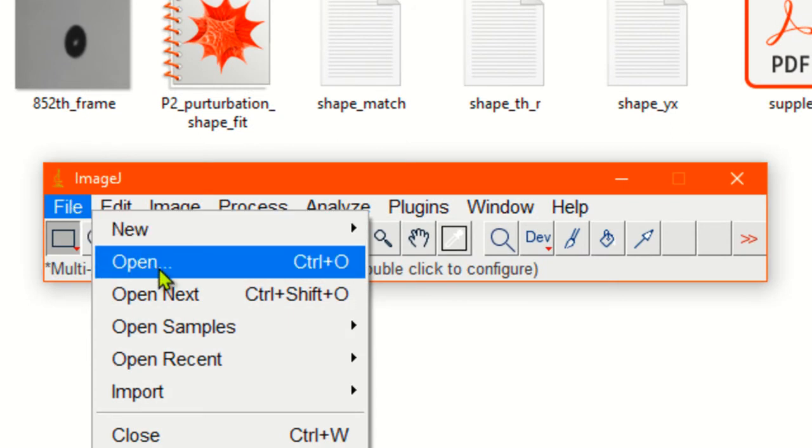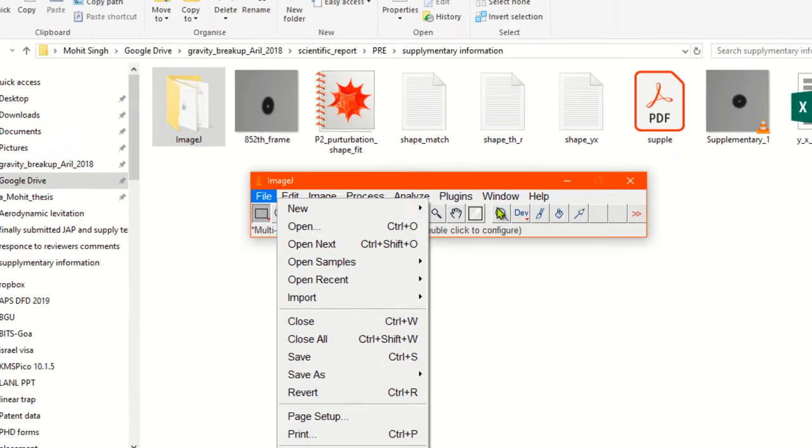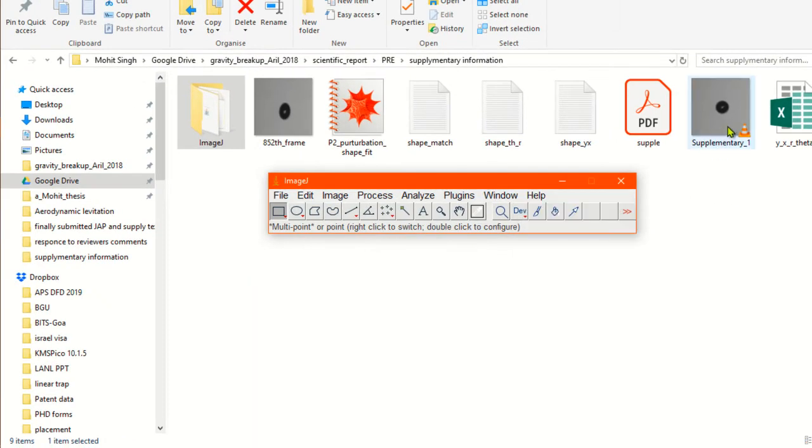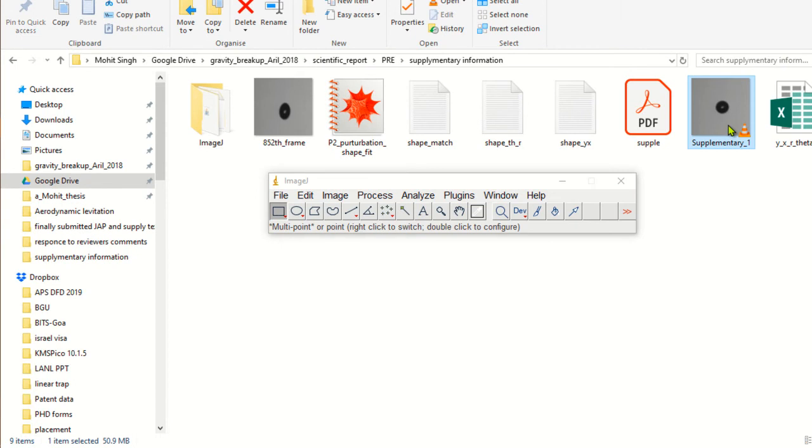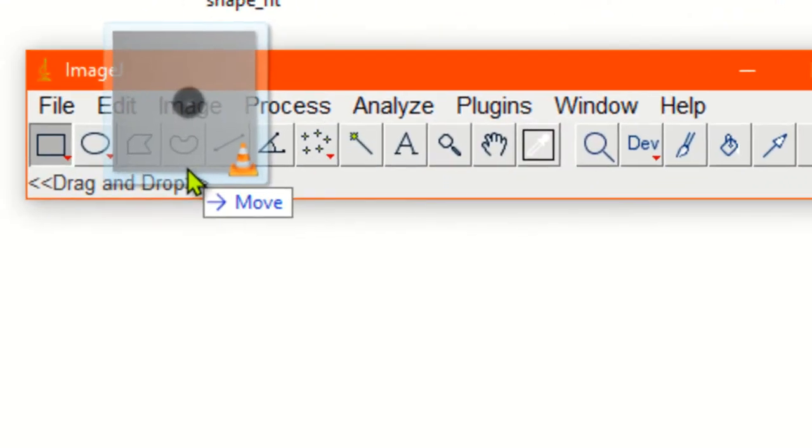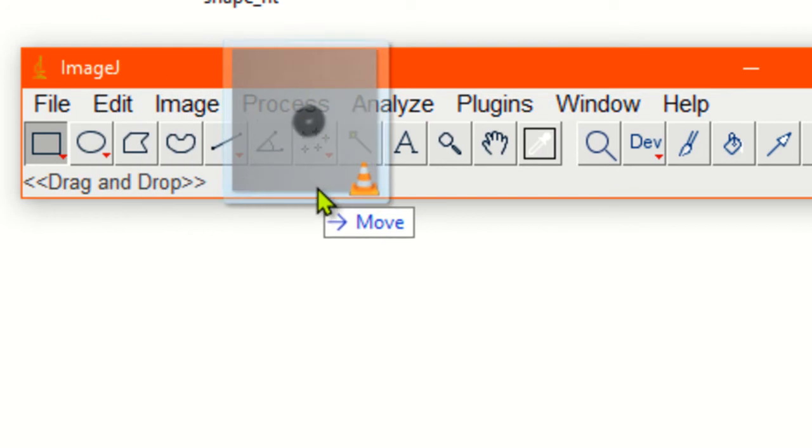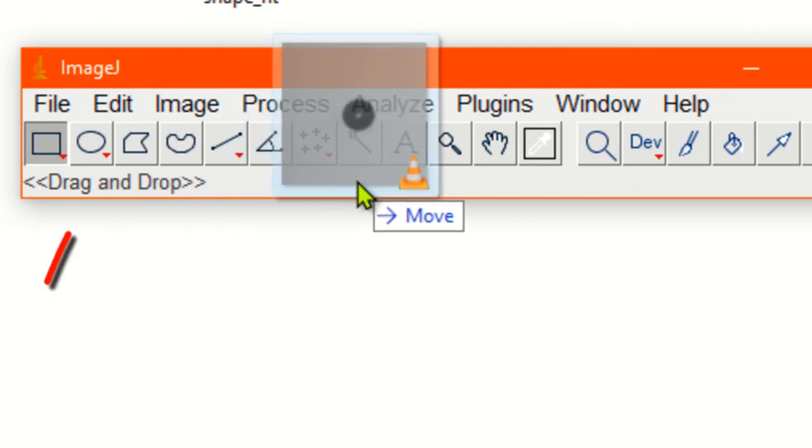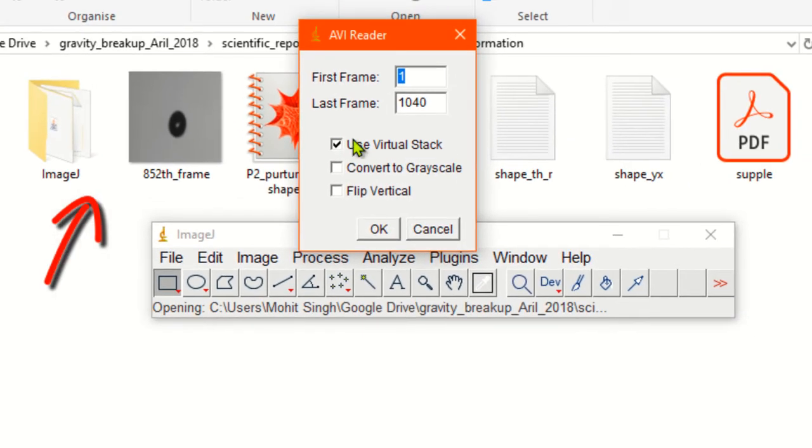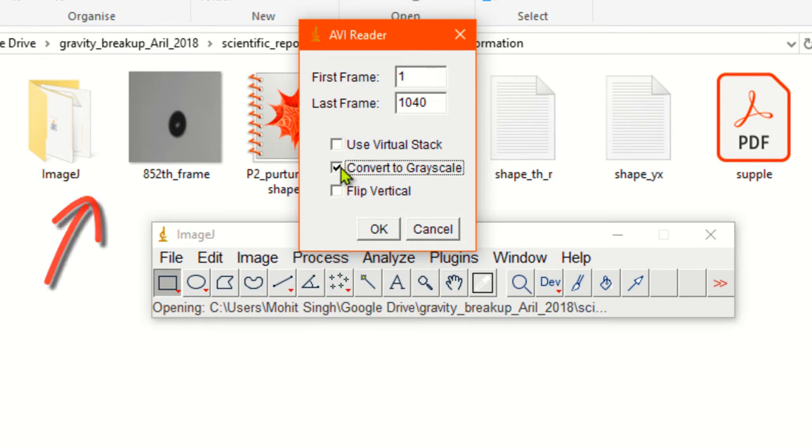We will open a video. Video can be opened by clicking on the file icon and clicking open and going to the folder. Or I'll tell you an easy method: simply hold the video and drag and drop.